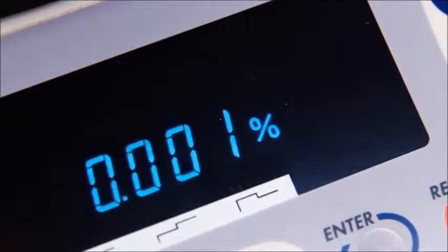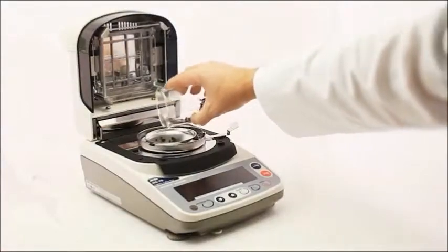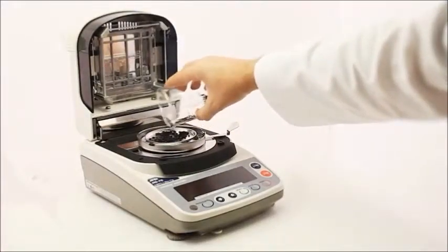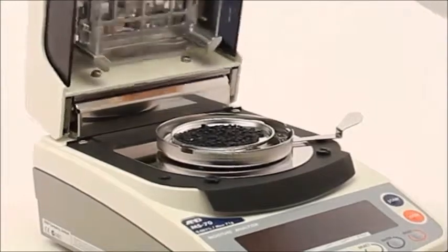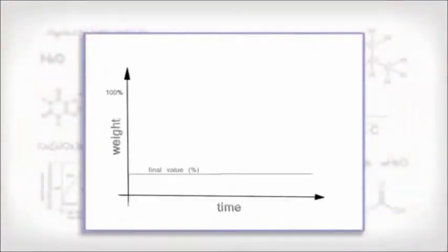The model MS-70 measures down to 0.001% moisture content with its resolution of 0.1 milligrams. Now even challenging low-moisture substances like plastic resins can be conveniently characterized.